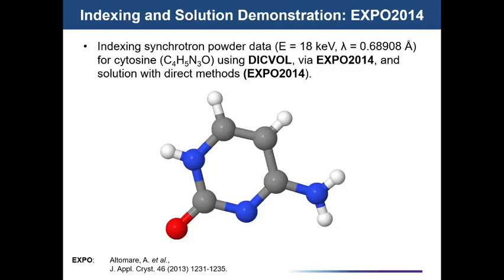So what it does is it goes through a little routine to find the peak positions. And this is not a big unit cell, so it found some examples really quickly. If you look here, there are 4 unit cells, but they're all quite closely related. The top one, which has the highest M20 of about 58, is orthorhombic. The next 3 cells are modifications on that orthorhombic cell, making it slightly monoclinic.